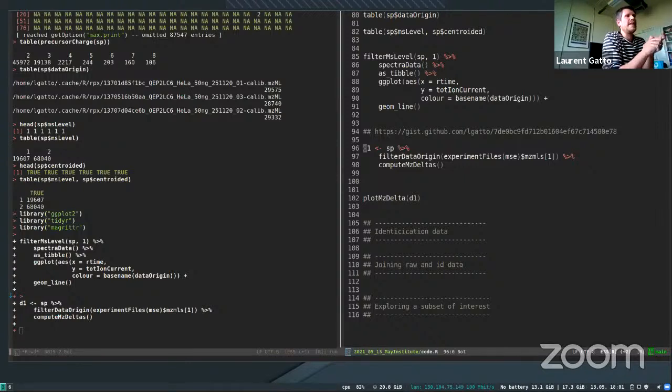And if the data that I have downloaded actually analyze peptides, and we know that's the case, then I expect that all these distances, these differences between fragment peaks in my MS2 spectra, correspond to the masses of amino acids. So this function is going to calculate all these distances between all the fragment peaks of all the MS2 spectra. Well, actually, maybe it's not all, only the fragment peaks that are in the top quintile or something like that. And so it's going to do that.